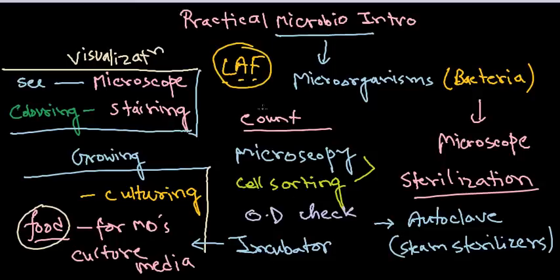You must have an incubator, a lab, a culturing media. You must have your desirable bacterial culture. Should have an autoclave in your lab, a microscope, stains. So these are the very, very primary things about all the basic microbiology tasks and work that you need to start in the lab. And now in the future videos, we'll be talking about each of those sections in detail.